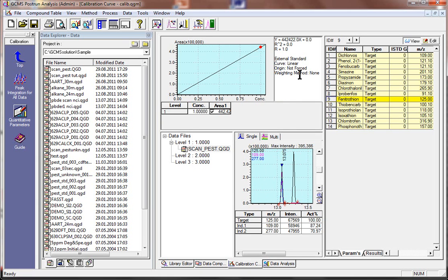To make a second calibration, it's the same way, a second level calibration here, so we would drag another data file for level number 2 in here, and so on. This is a manual way and can be done automatically in batch table processing. So this is now the way to create a method, and just saving that method means this method is now saved with a calibration curve.